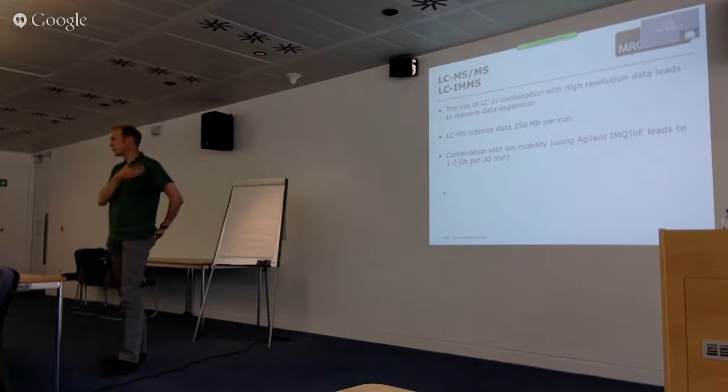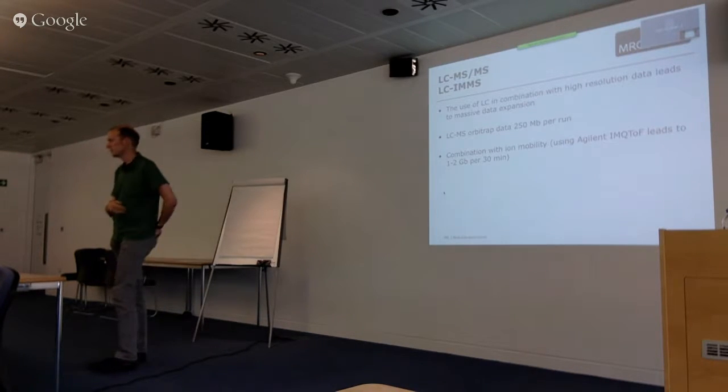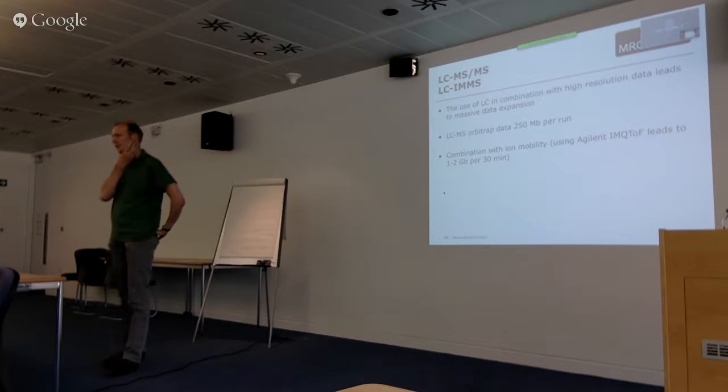Even in this study, we're only measuring the baseline sample, but there are follow-ups as well. So you'll agree that it's unusual. But we only use one method, the direct infusion, and it's only a 2 minute analysis.